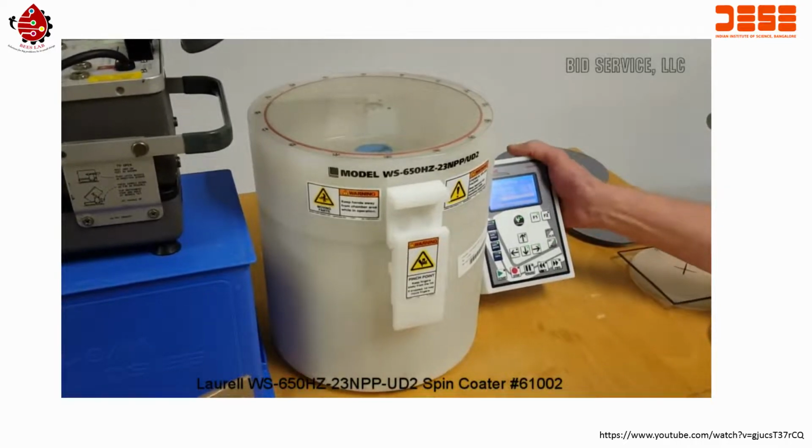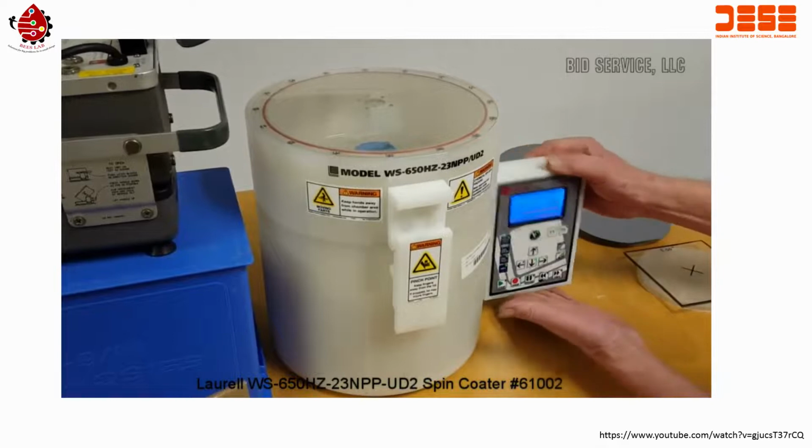First, this is the compact control panel, completely self-contained.